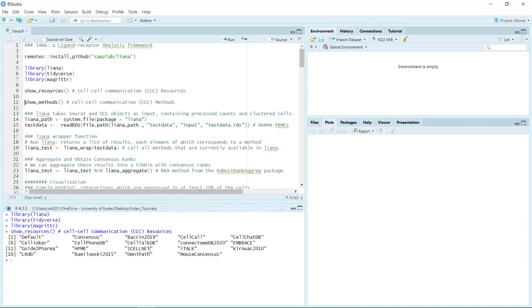You can see the databases for CellCall, CellChat, CellPhone, CellTalk, iTalk, Connectome, and OmniPath. You can also use the show_methods function to look at the available methods.